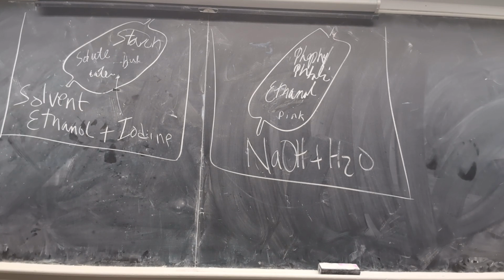Now, where's your solvent? Yeah, can I just put it in there? What's the smell like, water in the bag? This is supposed to get colored. Whatever is here, you can, but what do you expect to see when you put it in there? What color change? The solvent color is gonna change? No? The bag, yeah. So the bag is gonna change to what color?